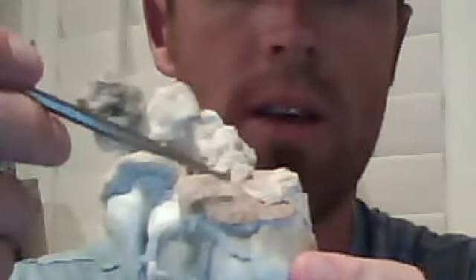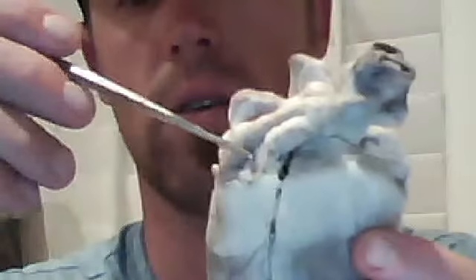Also, something that is visible on the heart are the auricles. This is the left auricle, and this is the right auricle. The purpose of the auricles is to increase the volume of blood into the atria.